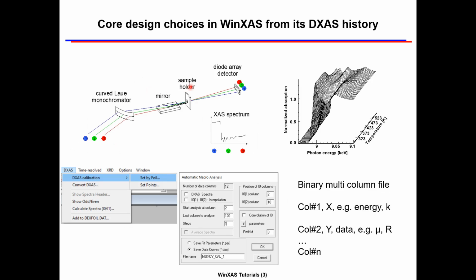Before we go into details with such a procedure, let's talk about the origin of WinXAS and some core design choices. When I started writing WinXAS for my PhD thesis, we were using energy dispersive EXAFS for time-resolved experiments. The spectrometer employed a position-sensitive diode array detector with a minimum measuring time in the millisecond range. Back then, computer memory was slow and expensive, so we used binary multi-column files for rapid access and small size. Those files contained 100+ spectra, and we needed some means to quickly read and analyze those spectra in some serial, automated manner, preferably using a graphical interface.